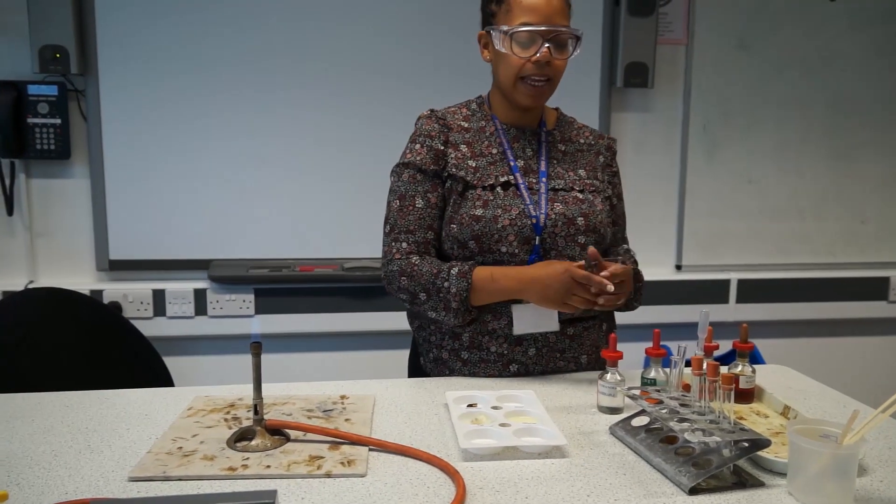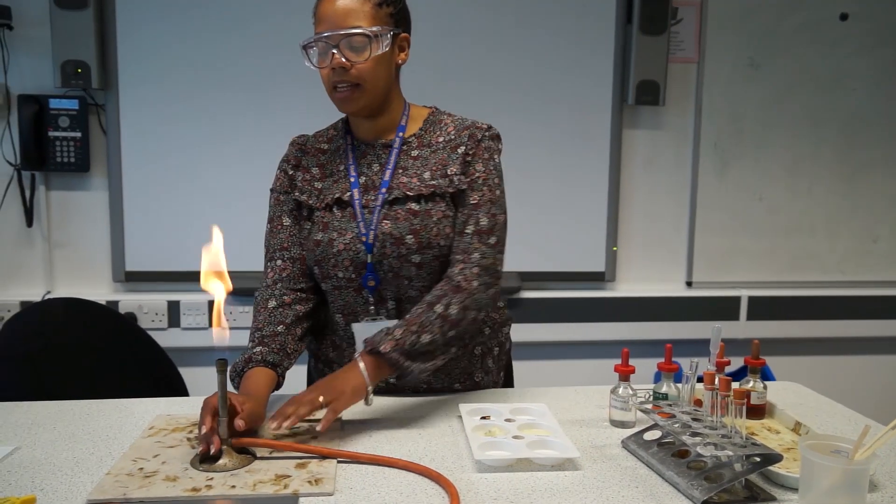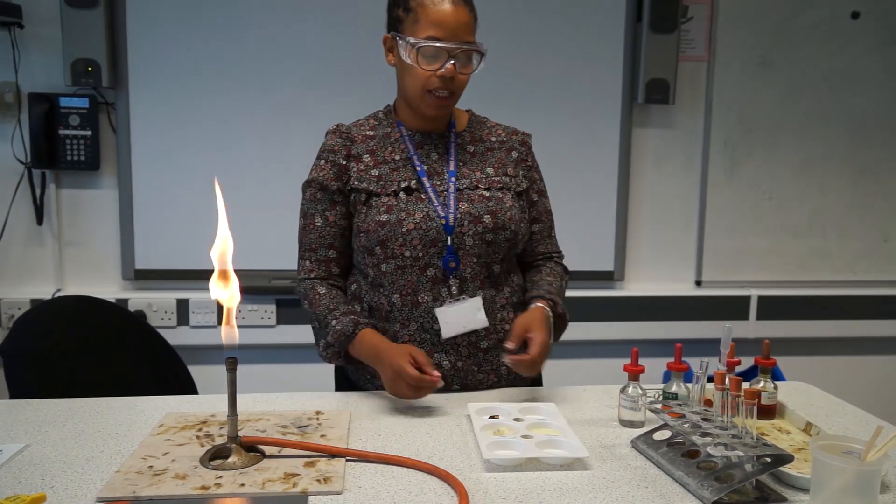Without touching it, I put it back in its test tube holder. I've changed my Bunsen burner back to the safety flame because I'm not going to use it.